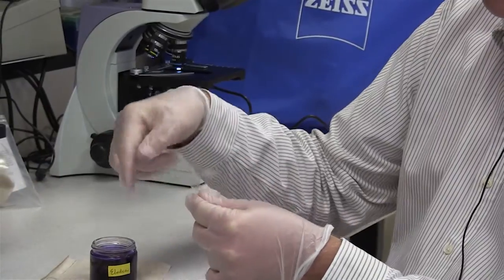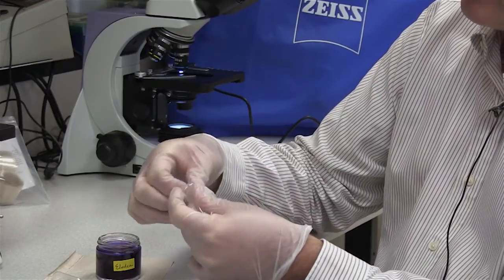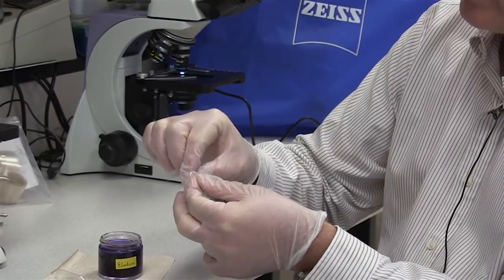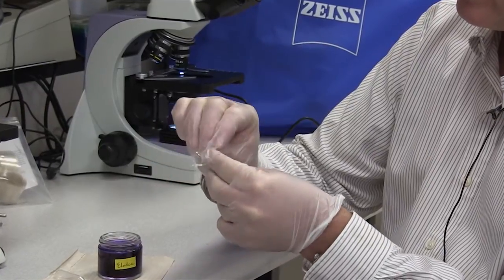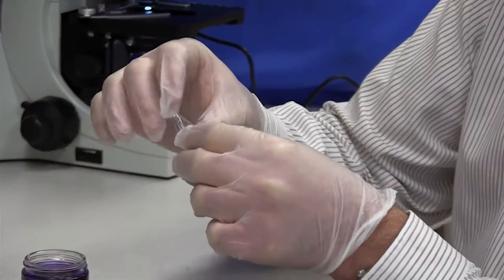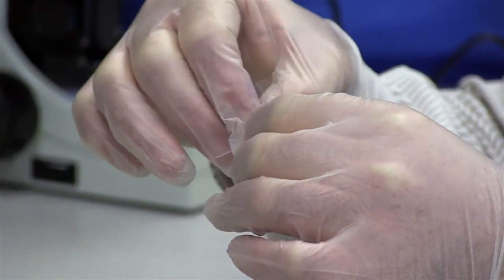I have gloves on because I'm going to be using a dye in a minute, and I don't want to turn my fingers purple. But the first thing we want to do is tie an overhand knot in the very end of the dialysis tubing. This is kind of tricky because you want to get the knot very close to the end of the tubing. As close to the end of the tubing as you can.